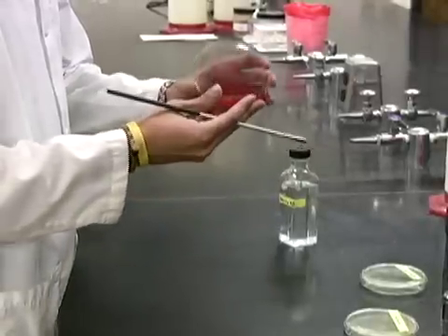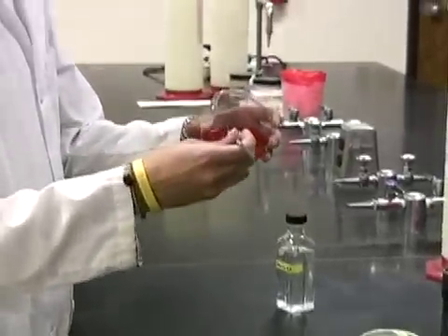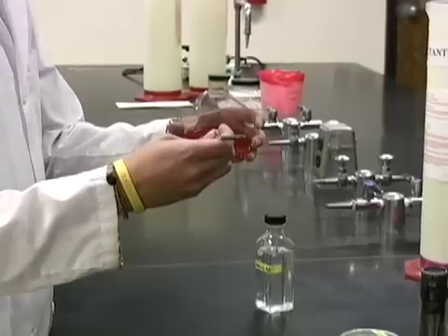Do the same thing to the other half of the plate. Invert the plate and place it in the incubation bucket on the side bench.